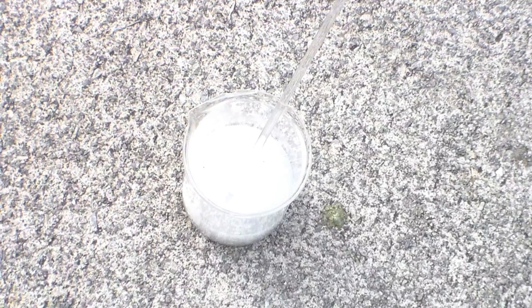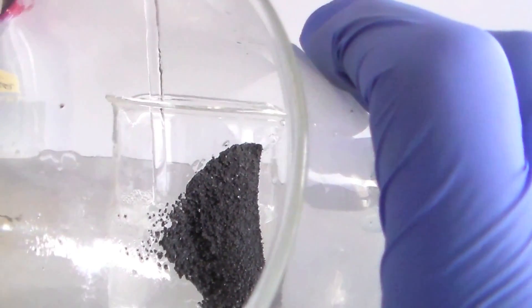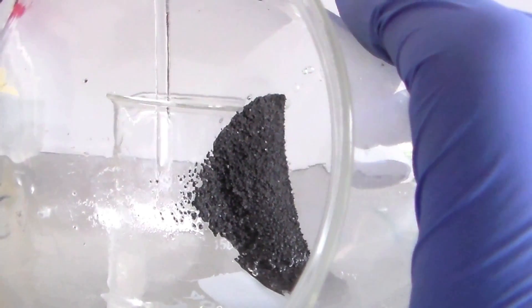However, on the bottom of the beaker is a dark black insoluble powder, which is a pretty good indication that we have actual silicon.